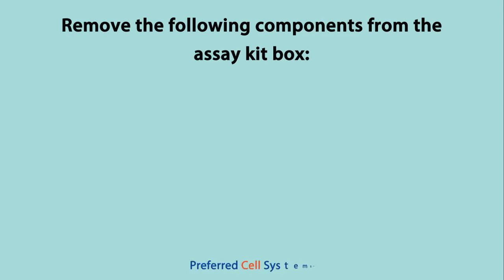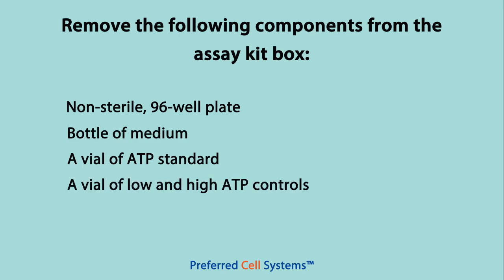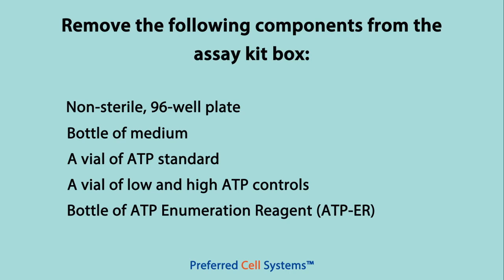This calibration and standardization protocol can be found in any ATP bioluminescence assay kit manual, which can be downloaded from the Preferred Cell Systems website. To perform this step for any ATP bioluminescence assay from Preferred Cell Systems, you will need to remove the non-sterile 96-well plate from the assay kit box, as well as the bottle of medium, a vial of ATP standard, a low and high ATP control vial, and the bottle of ATP enumeration reagent.